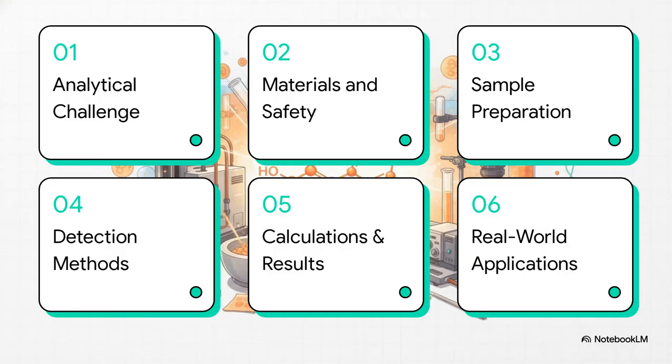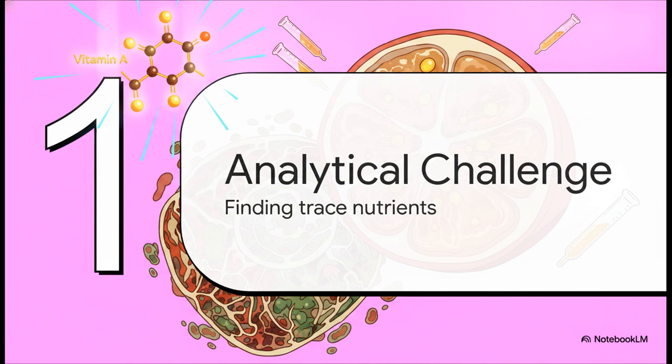Here's the roadmap for today. We'll cover the analytical challenge, materials and safety, step-by-step sample prep, chromatography and detection, calculations and results, and finally, real-world applications. All right, Section 1, the analytical challenge of finding trace nutrients.